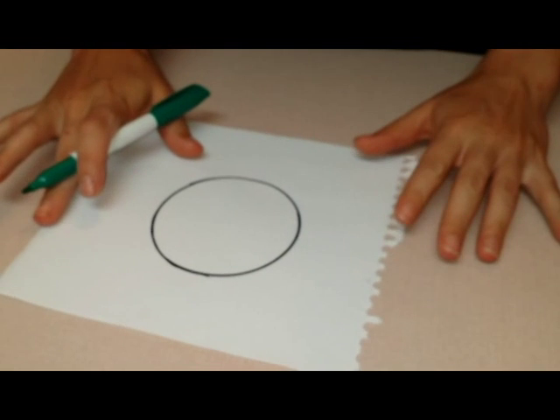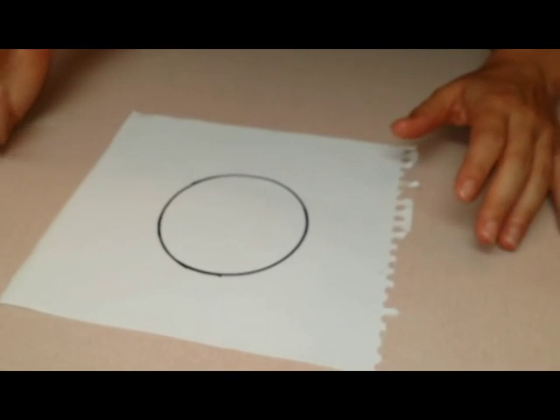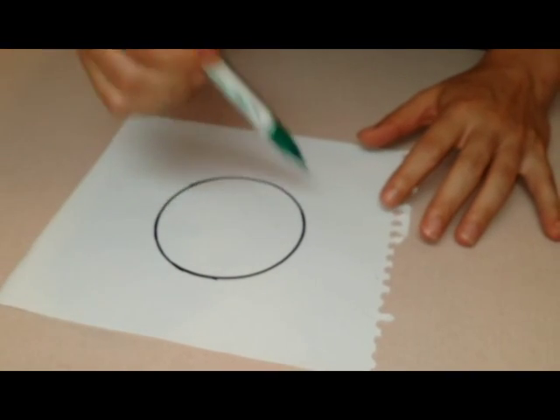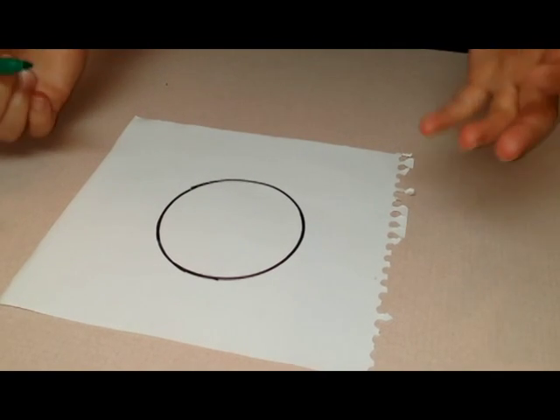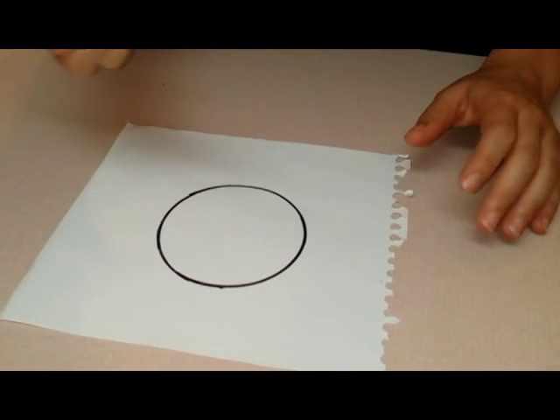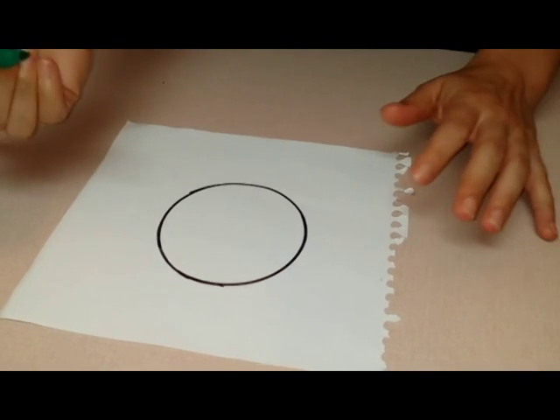So you want to know how to streak to single colonies aseptically. Pretend that this black circle is your petri dish full of agar and that this green marker is your inoculation loop.